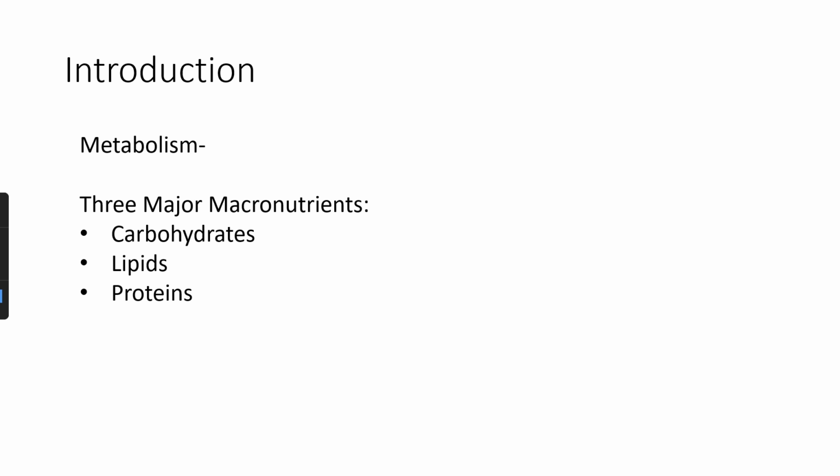Well, we can put the bacteria in a tube with some sugar and a pH indicator. And if that bacterium has the ability to eat that sugar, it'll eat it and then produce an acid waste product. And that gets detected by that pH indicator. So we started figuring out, well, if we put the bacteria in a tube with select types of nutrients, and if the bacteria can eat it, it's going to cause a pH change, which is going to cause that indicator to turn colors. That's how we can start to list characteristics of the different microorganisms.